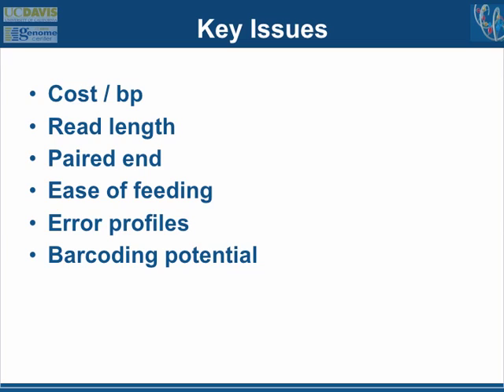There's something that still keeps this old terminology, although it's not always used in exactly the way it was used originally, called paired end sequencing. The terminology comes from sequencing from the two ends of a plasmid vector, in essence. And there are a lot of different ways that people apply something like this to try and read sort of pieces of DNA that are a set unit of distance apart in the reference DNA sample. And when you constrain that set distance, you can use the paired end sequence data to do mapping of some kind or genome assembly.